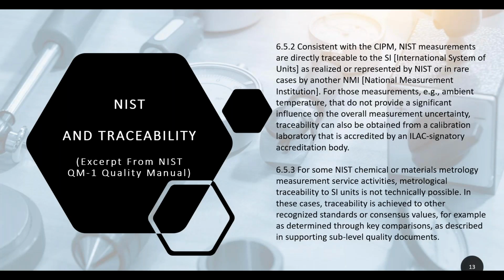So NIST and traceability. A lot of the requests that we get is that the devices are NIST traceable, which under the current ILAC agreement for interlaboratory calibration laboratories, we're not traceable to NIST, we're traceable to the SI, the international standard for the measurements. So I took this from the NIST QM1 because NIST has the best way to word this.